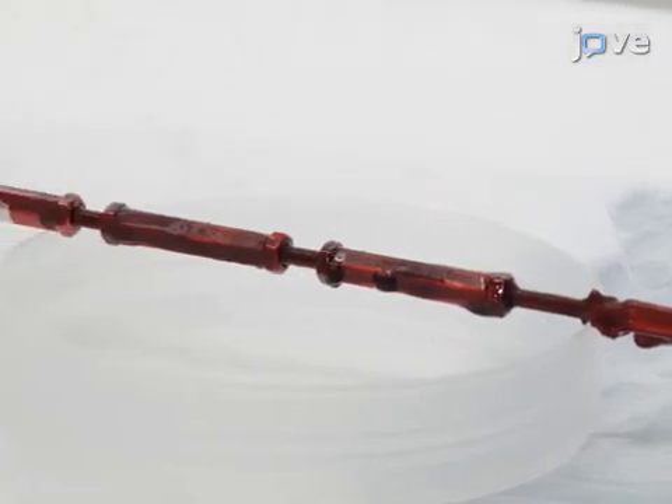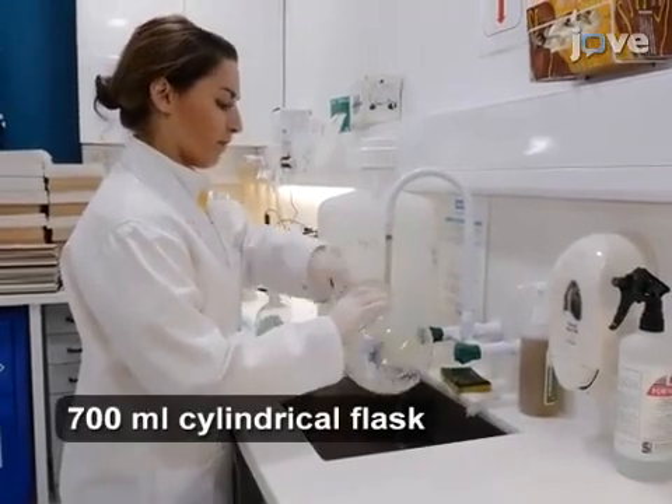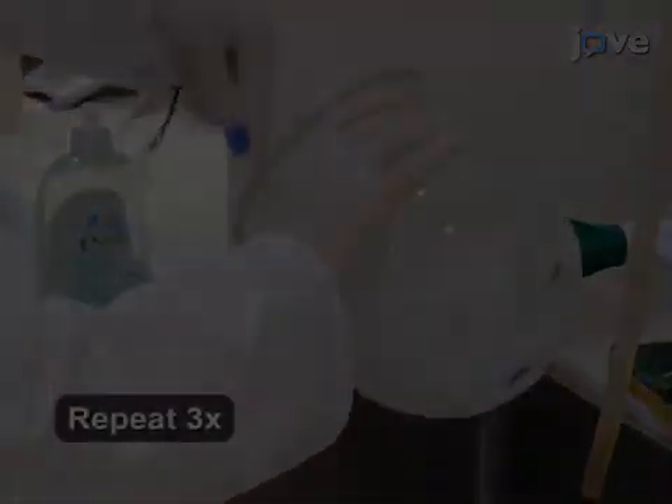Clean the corrosion vessel before every corrosion run. Scrub the vessel with household detergent and rinse thoroughly with tap water. Repeat this step three times.